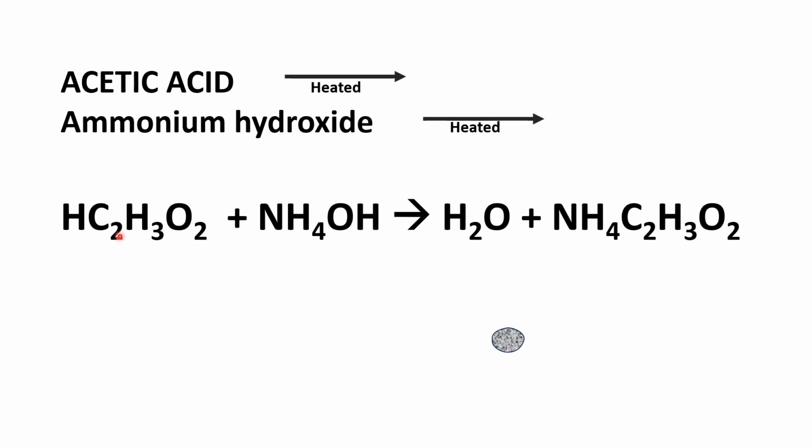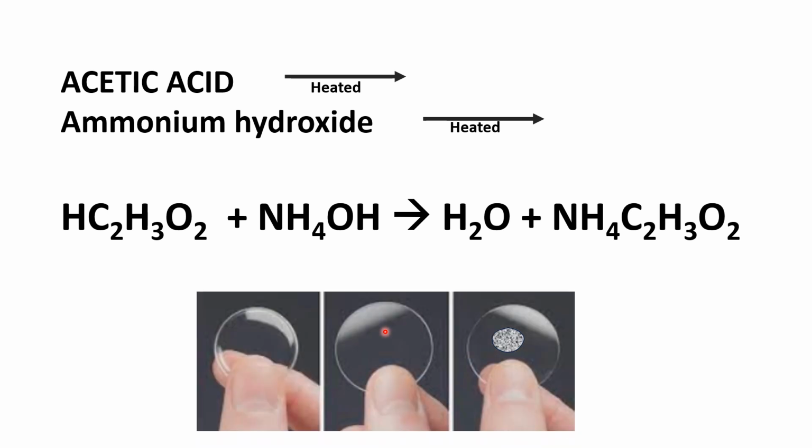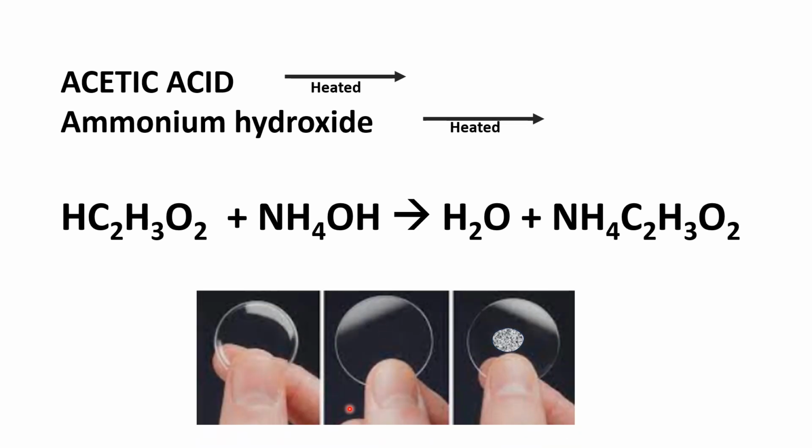So this will be a neutralization reaction where you produce ammonium acetate and water. Since it is now producing a salt as product, it will leave behind a residue after the mixture was evaporated to dryness on a water bath.